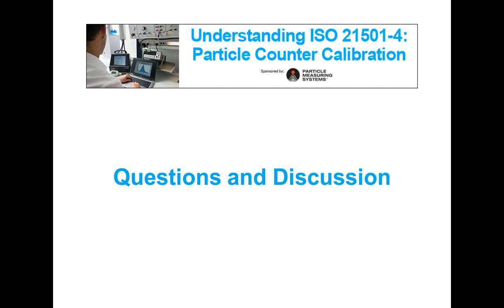And also on the subject of alarms, this question came in. Does this instrument monitor 24 hours, 7 days a week, and report or alarm out-of-range measurements of particles or microbes? So if the question is whether the instrument is able to provide alarms, yes, that's what it looks to be. Does it monitor 24 hours a day, 7 days a week, and does it report or issue an alarm for out-of-range measurements of particles or microbes, which seems to be a bit of a follow-up to that last question.